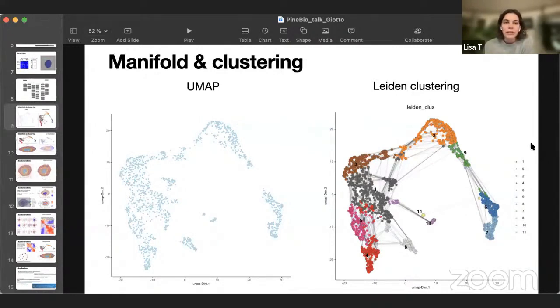Well, I think that there are options when we don't really need spatial imaging or we can't really capture it. Looking at the pipeline, it looks like all the steps we do are the same as single cell, so we can replace all the single cell projects with spatial single cell. And I think that's a good idea, but still, I guess there are options when we can't really use spatial single cell, so we can continue working with just regular single cell.